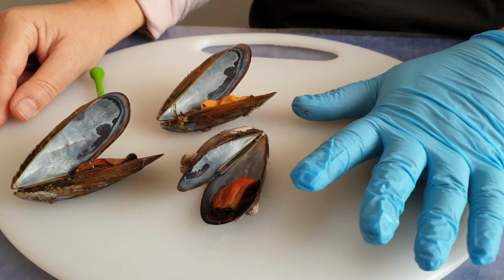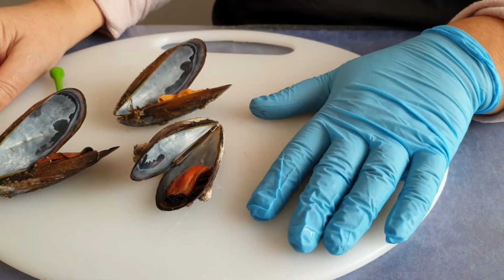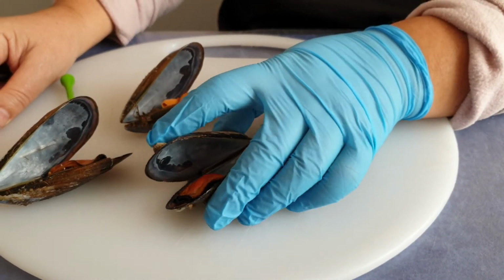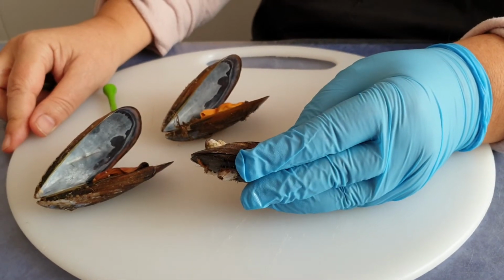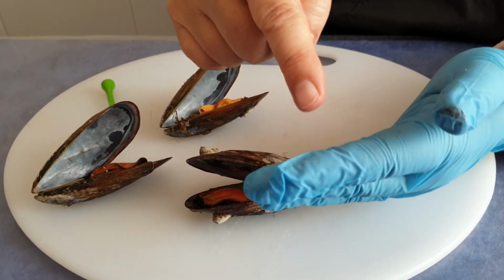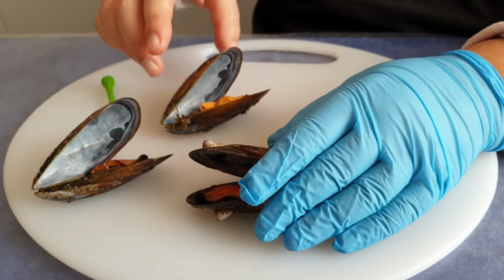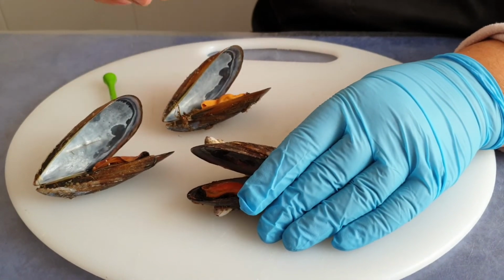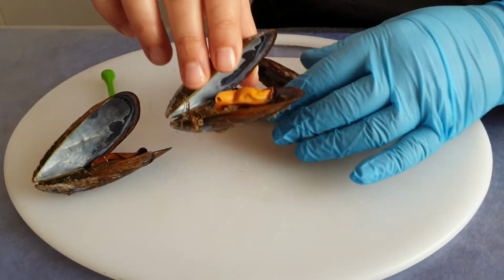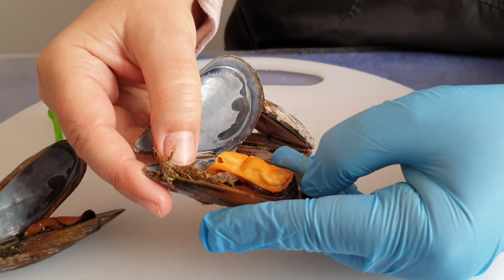Imagine that my hand is a starfish. You know that starfish love to eat mussels. So they go there and they try to open the mussel. And they do it with the tube feet that they have in the bottom of the starfish. So mussels need to defend against this attack. And for that reason, they have powerful muscles. Now we are going to see these muscles.